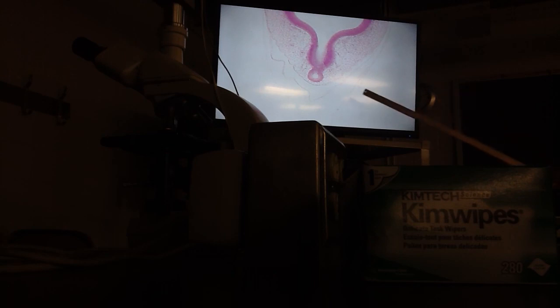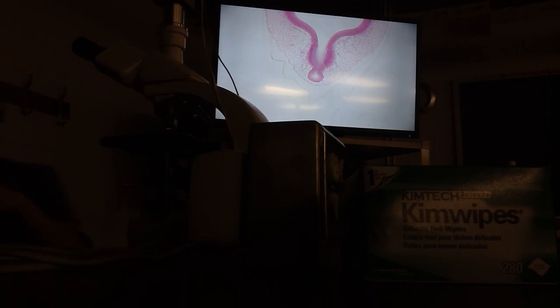So what is this blob? That's the epiphysis, and the diencephalon is right above it. So there's not much diencephalon. Little tiny diencephalon. Okay? And beginning of cerebral hemisphere formation. All right? Is it good? Do you remember that? You will put that on the exam.